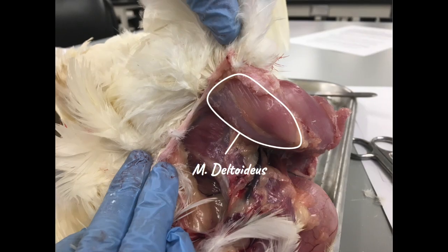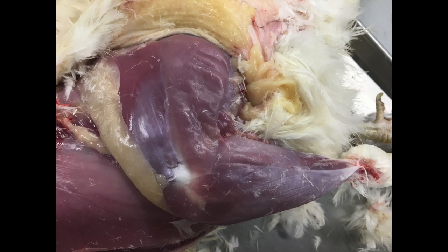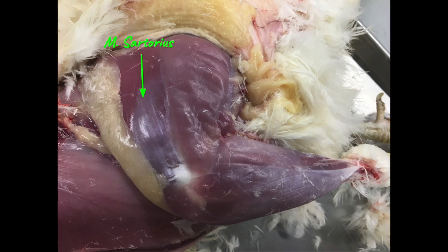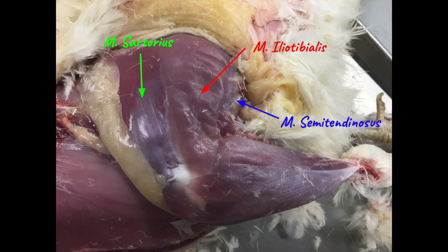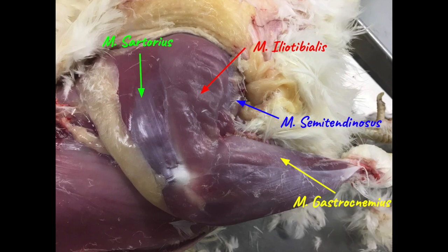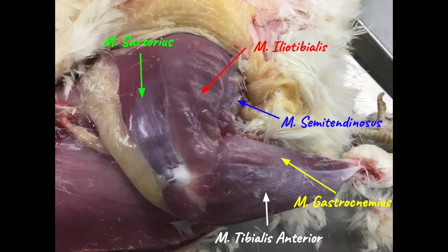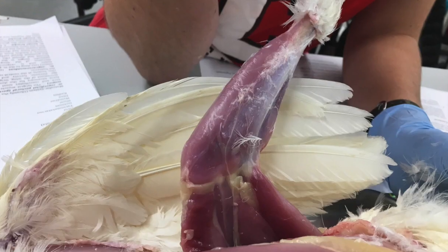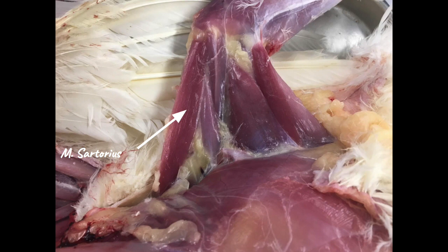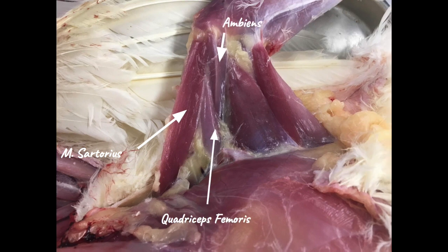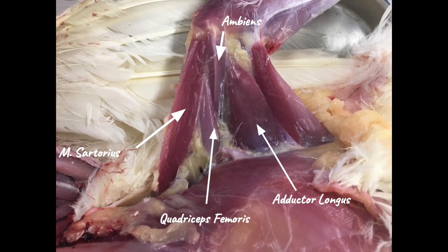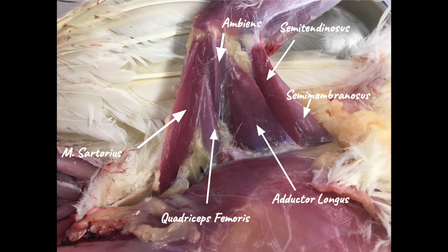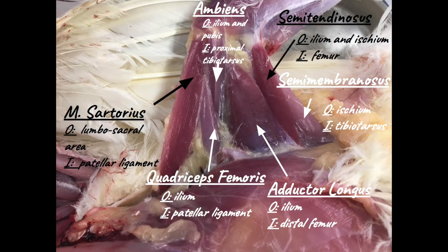This is the deltoideus muscle, behind the shoulder of the chicken. Next are the muscles of the thigh and leg. These include sartorius, iliotibialis, semitendinosus, gastrocnemius, and tibialis anterior. In addition to sartorius and semitendinosus, here you can also see quadriceps femoris, ambiens, adductor longus, and semimembranosus. Their origins and insertions are shown here.